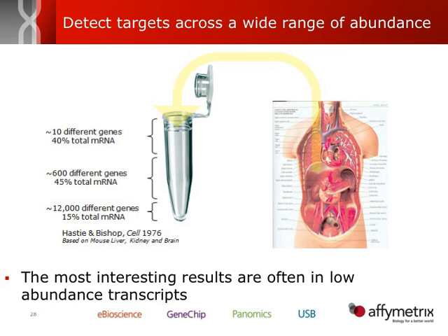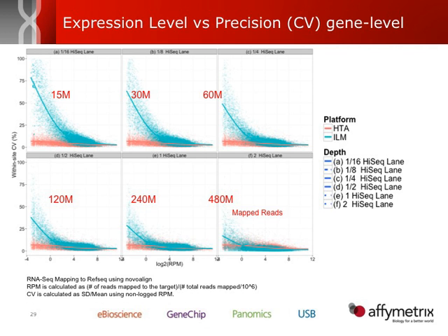So what that means is that the rest of these genes are in a relatively low abundance in your sample versus the other genes that are expressed at a very high level. Those would be at a very high abundance. And what we're finding is that a lot of the interesting biology is being found now in these low abundance transcripts, these transcripts that are expressed at a very low level and can have a very profound effect on your biological system.